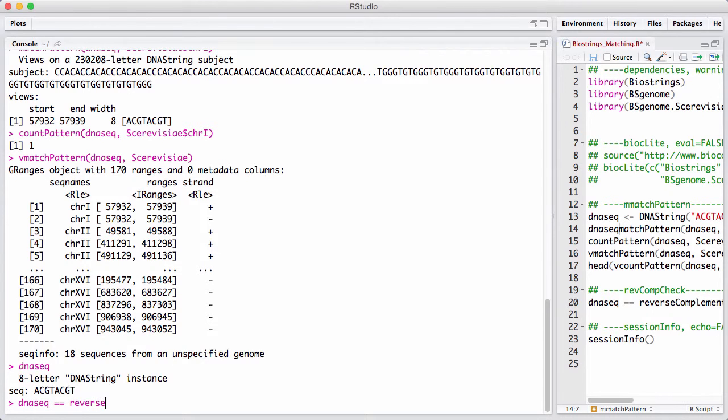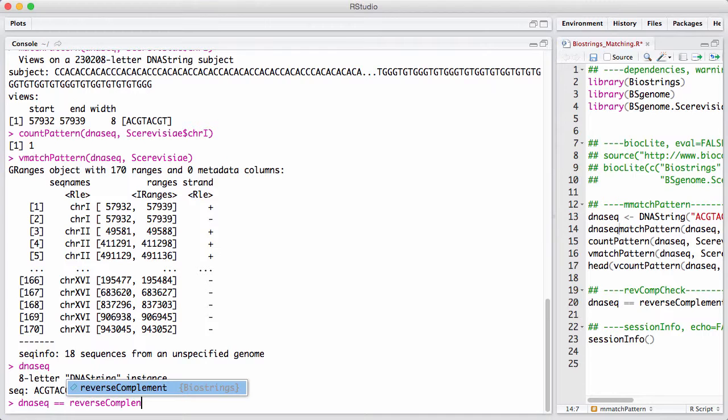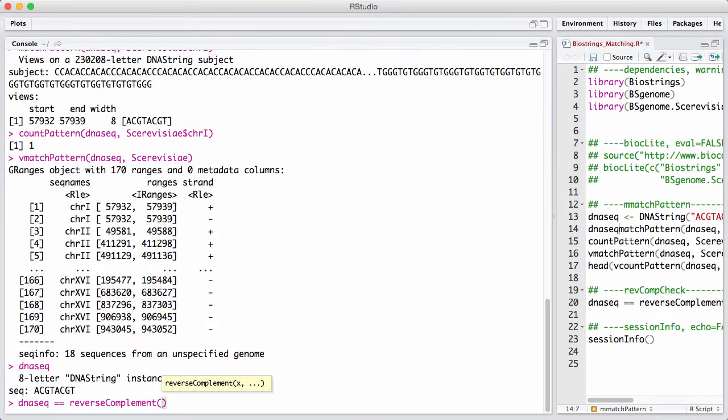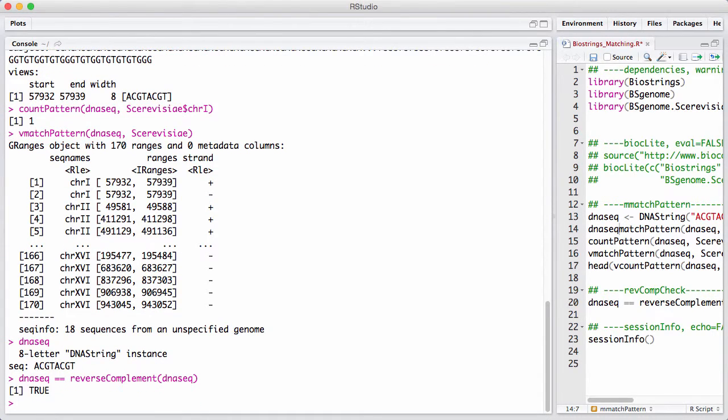We can check that by asking, is DNAseq equal to reverse complement of itself? And we get true, and that's why whenever we have a hit on the forward strand, we have a hit in the same location on the reverse strand. This is not an error.